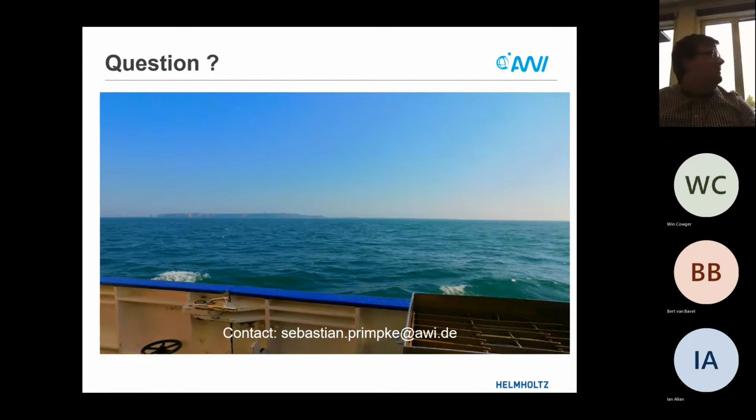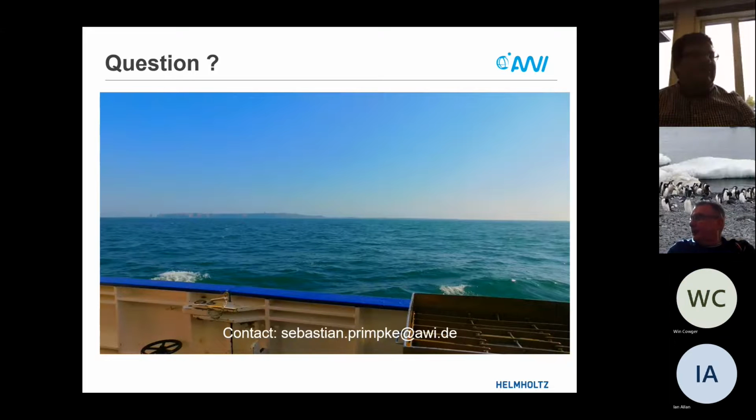I got one. So this is one I think a lot about, because I think there are probably more gremlins hiding in the data analysis besides cuticles. A lot more, yeah. There are other things that we don't yet have included in our libraries that are going to throw off feature analysis, totally distort what we're seeing. How do we develop a system for flagging that in our tools so that we can say, oh, this one's probably not in the database? What is that algorithm?